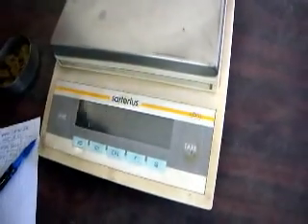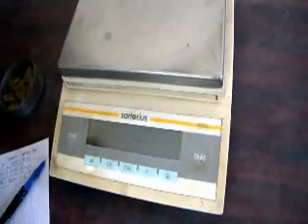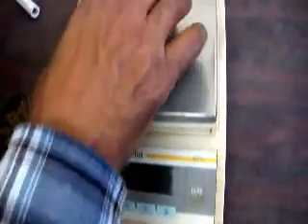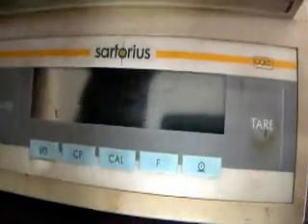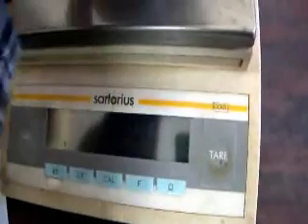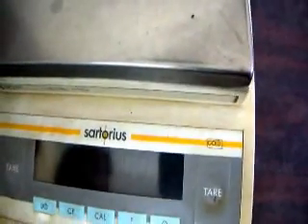Let us go for 45 centimeter first. So it's the 45 centimeter box. Removing the soil and taking the weight, that is 19.62 gram, 19.60 gram basically.